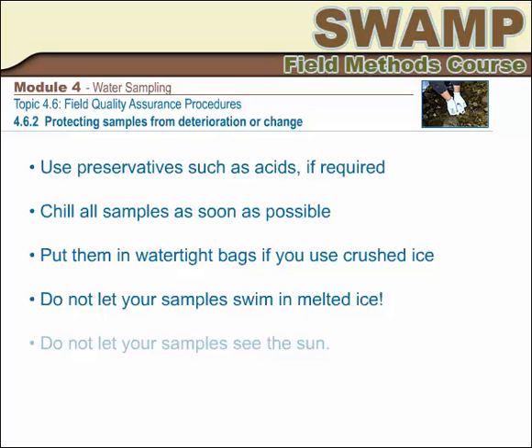Sample temperature should be maintained at 4 degrees Celsius until delivered to the laboratory. If this is a long process, consider refreshing the chilling devices if it does not interfere with custody seals. Care should be taken at all times during sample collection, handling, and transport to prevent exposure of the sample to direct sunlight.